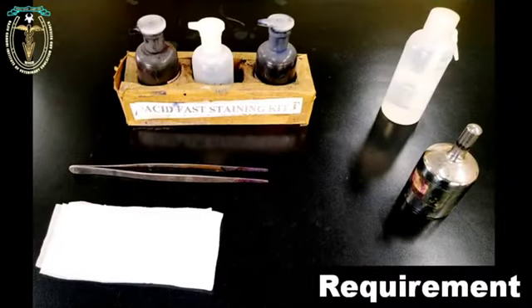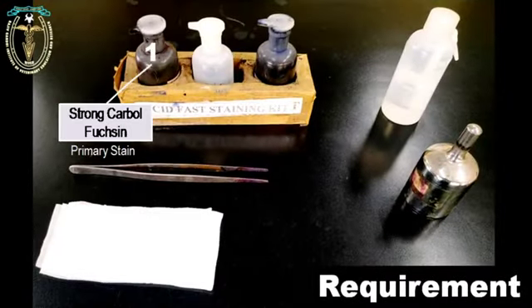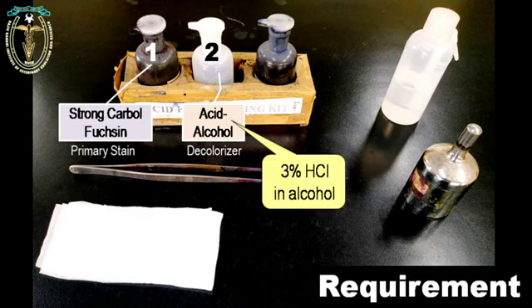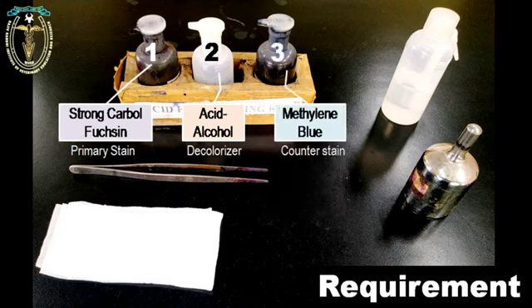The materials required are the strong carbolfuchsin staining solution, which is used as a primary stain in this experiment; the acid alcohol, used as a decolorizer, which is prepared using 3% hydrochloric acid and 95% alcohol; and the Loeffler's methylene blue staining solution, which is used as a counterstain. These are the three important solutions required for conducting the acid-fast staining technique.